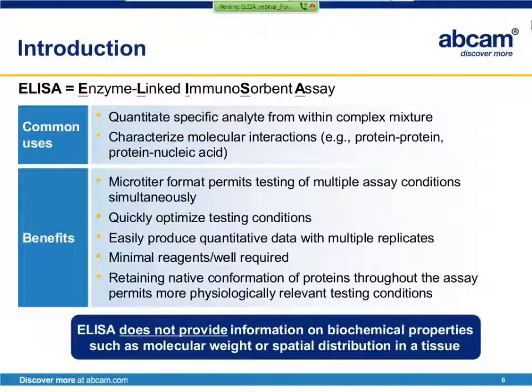It's important to note that ELISA does not provide certain information, such as a target's molecular weight or pattern of distribution within a cell or tissue.